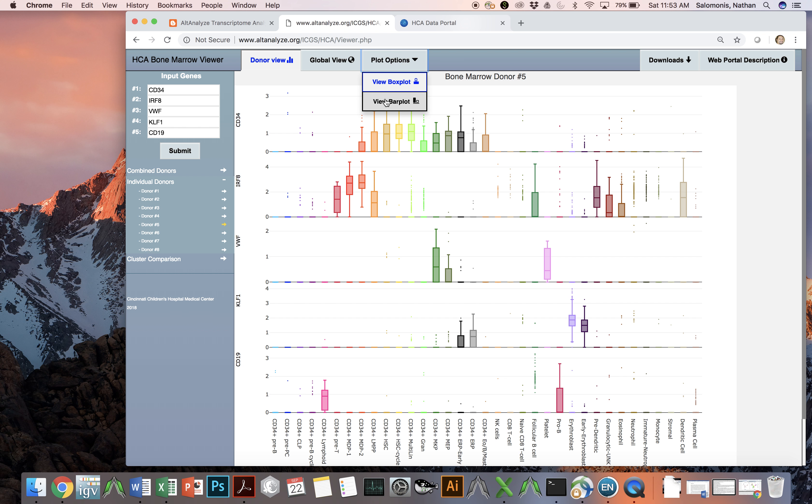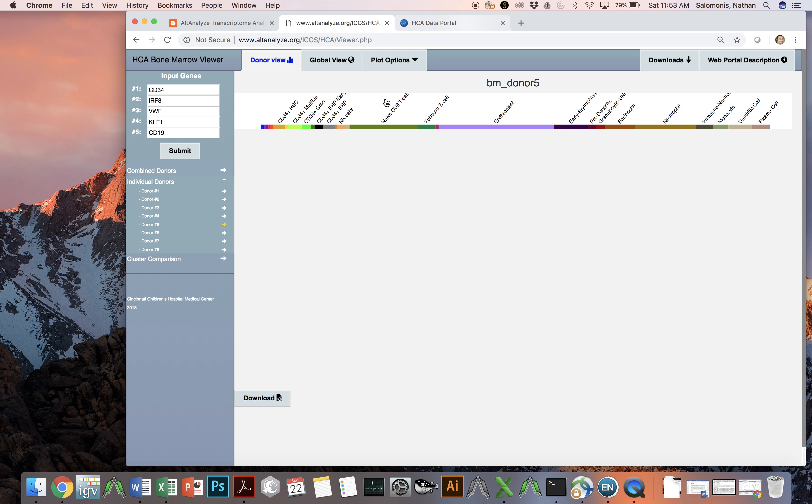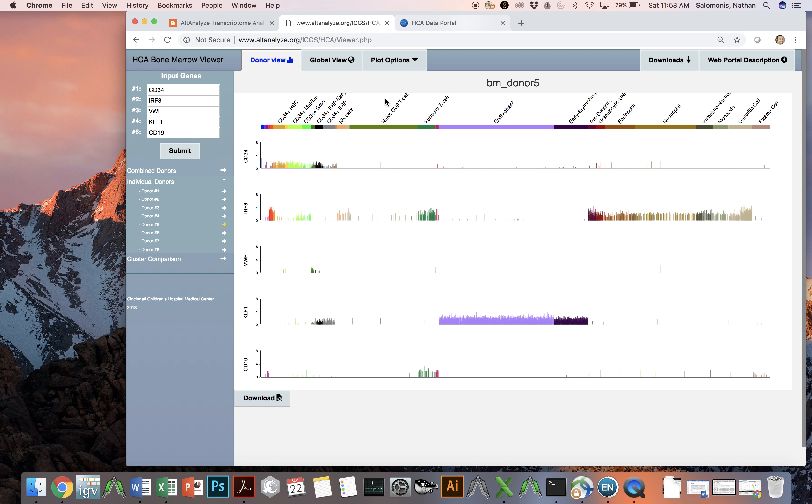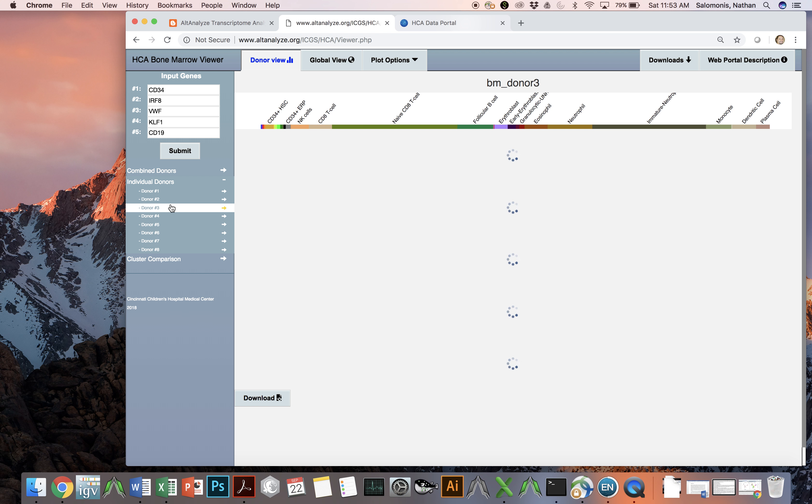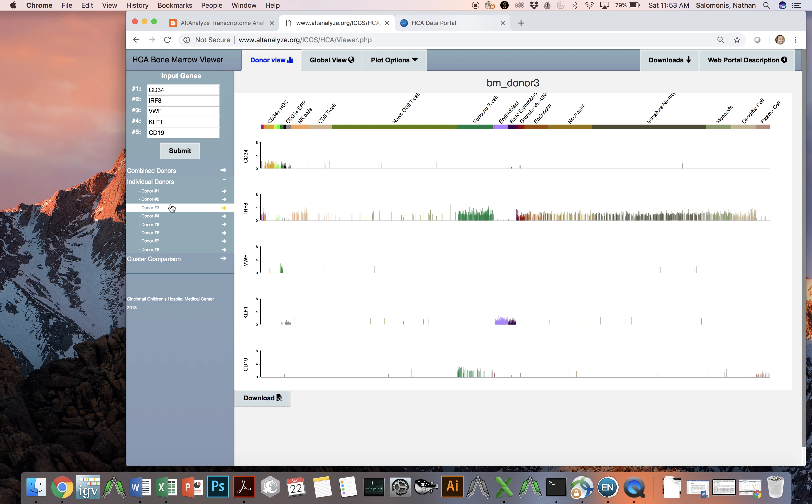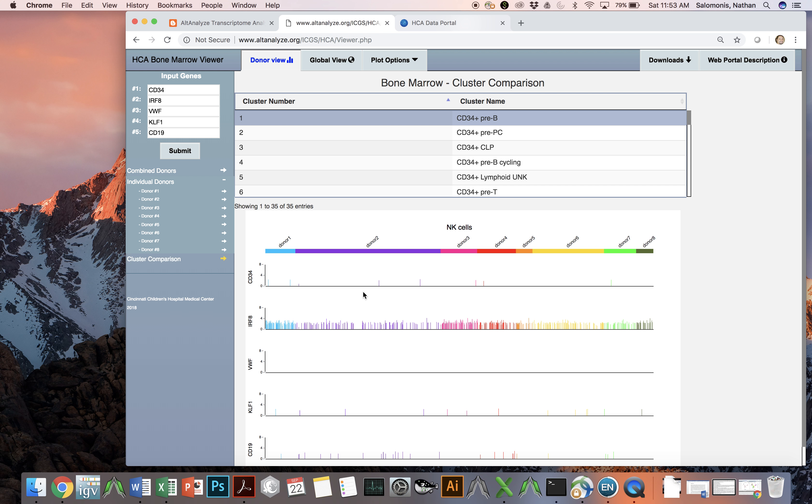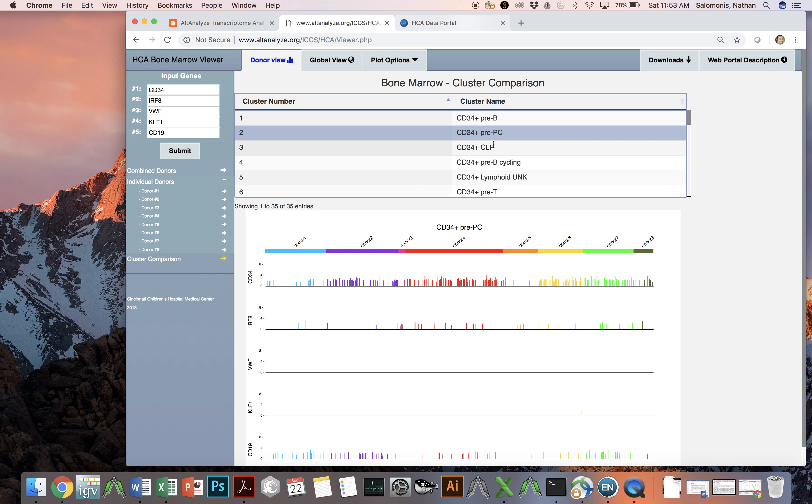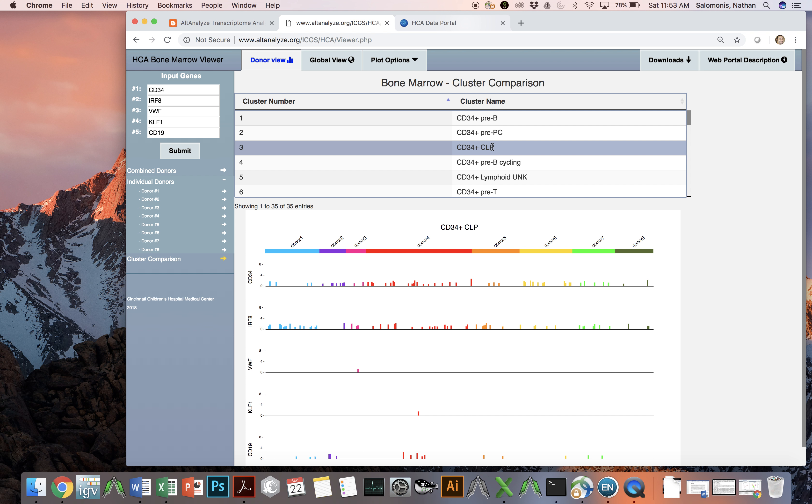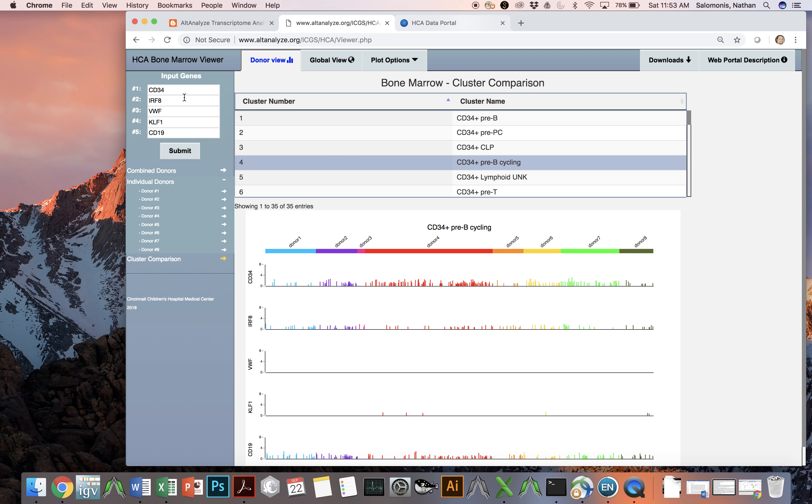You can also change the visualization option, in this case from box plot to bar plot. And now you can see the expression of individual cells within each individual donor. And again, you can switch between donors and see the variation within or across donors. You can compare the expression of genes within specific clusters or across clusters in regards to specific donors to see what the variation in gene expression there is. And simply, you change the cell populations you look at by selecting different cell populations in the top. And again, you can change the specific genes in this panel up on the left.